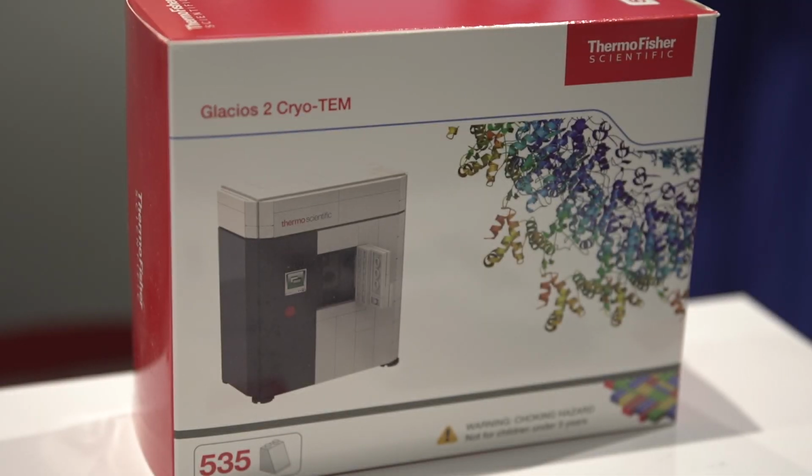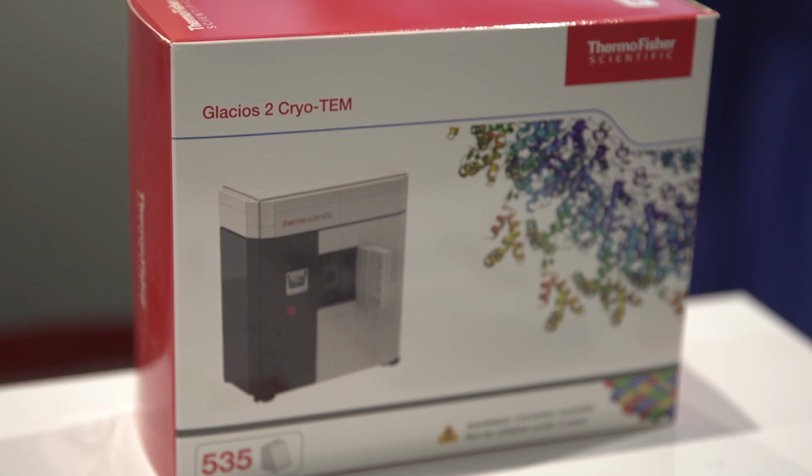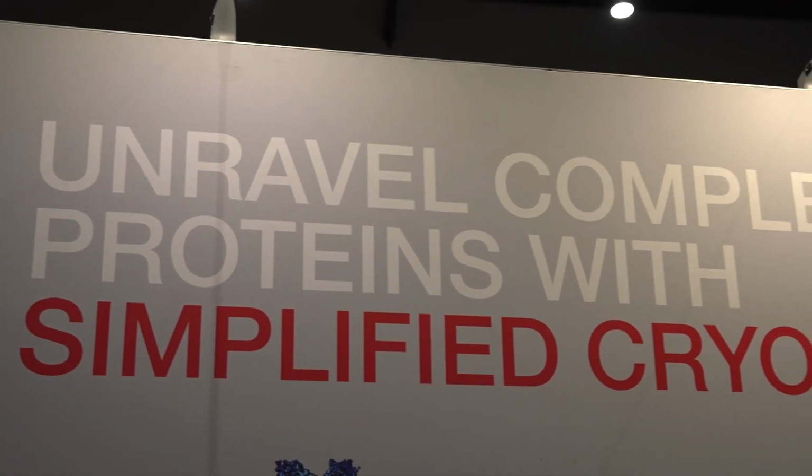So the Glacios 2 is our newest platform for cryo-electron microscopy, and really can enable all three main workflows: micro-ED, single particle analysis, and tomography. And really the Glacios 2 is built around ease of use, and so a number of features around the tool enable non-expert microscopists to use the tool. And I think one of the big things that we added to the Glacios 2 is a software component with Smart EPU, and really that just enables users of all skill levels to start acquiring really high quality data with minimal experience.